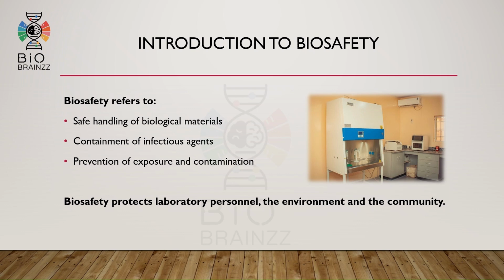Biosafety refers to the safe handling of biological materials and the containment of infectious diseases. The main goal of biosafety is to prevent exposure, contamination, and laboratory acquired infections. Biosafety protects laboratory personnel, the environment, and the community.